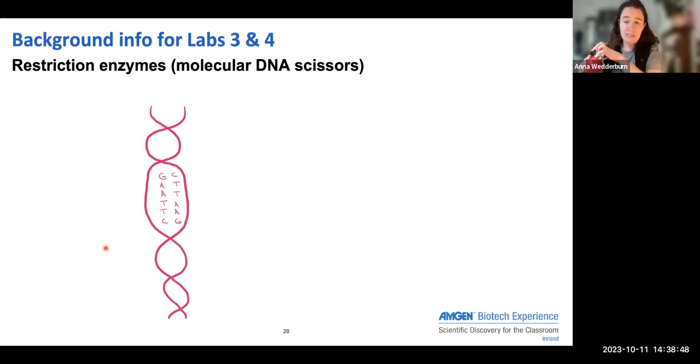So that's lab 2, all done. It's a pretty simple one. It's just gel electrophoresis. It's just loading the samples. That's it. And all of this information, summaries of all this information, will be given to you on cheat sheets in your kit loan. And we also have this available on Lab Exchange as well.